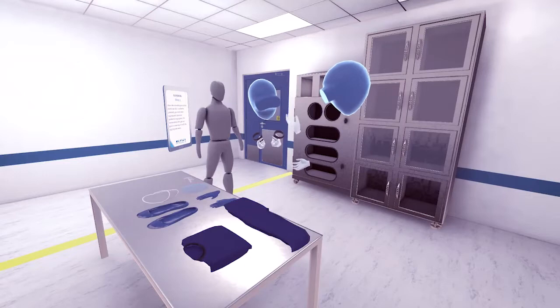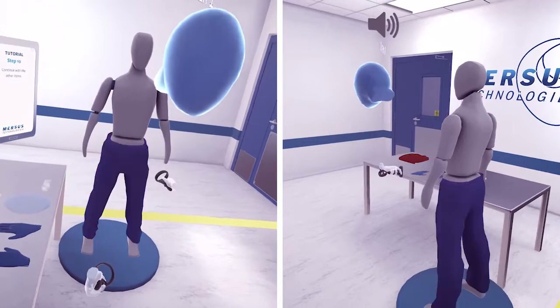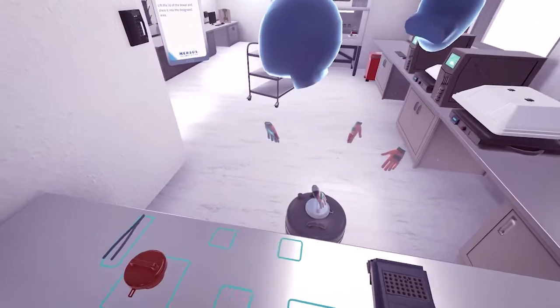By way of an avatar, trainers can join trainees in the virtual lab from any online location, reducing the risk, costs and carbon footprint of global organizations.